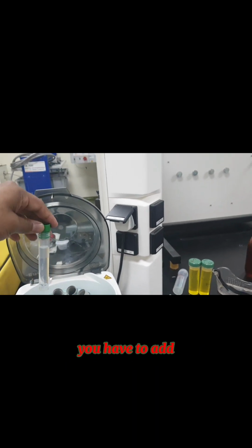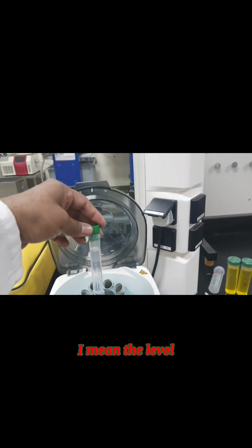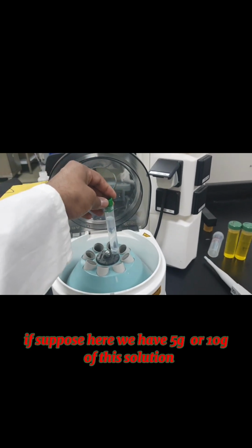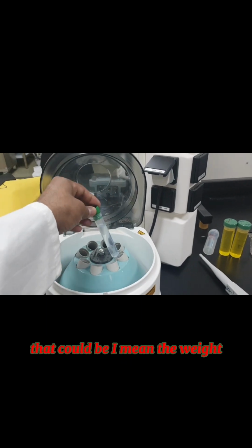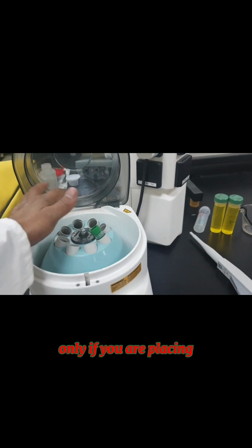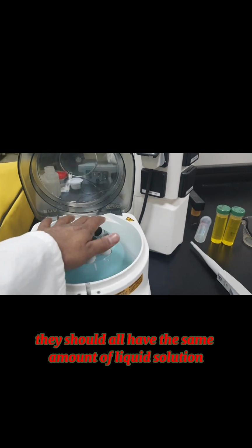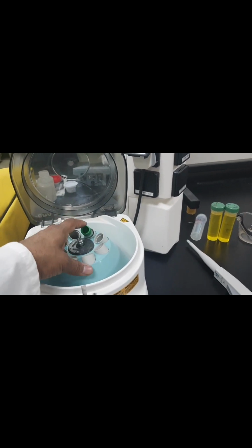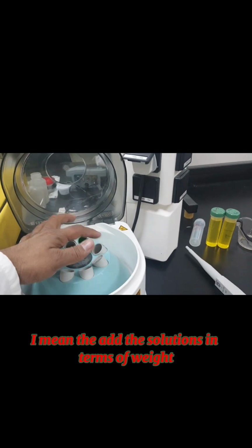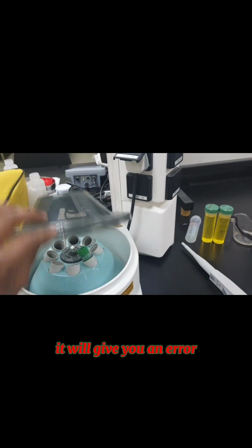So what you have to do is add the solution, and they should be leveled. Suppose here we have 5 gram or 10 gram of this solution, that could be the weight, or you can put it here, so it has to be diagonal. And if you are placing the vials with solutions here, they should all have the same amount of liquid solution, or you can say the same volume. So better we add the solutions in terms of weight. If the weight is not balanced, it will not run, it will give you an error.